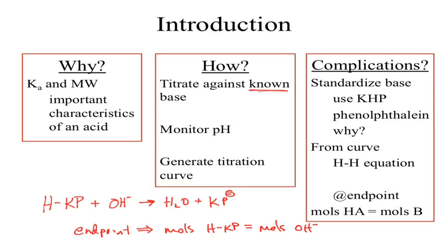How do we get the volume to get our molarity? How did we get the OH minus added to the solution? Through a burette. With the burettes, they're all marked with volume on it. We can then divide our mole amount by the volume of water added, or the volume of our solution, and we've got the molarity of our base solution.